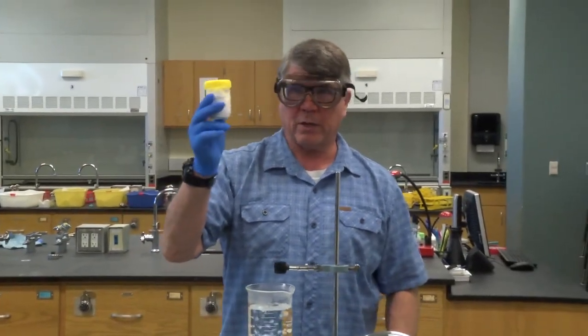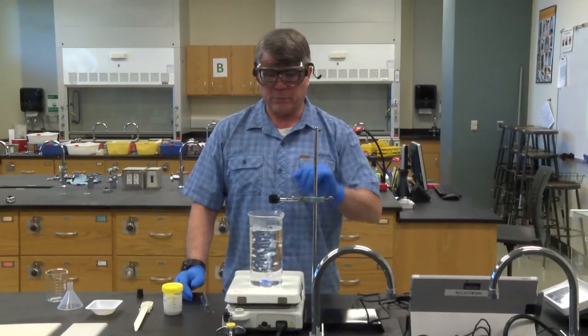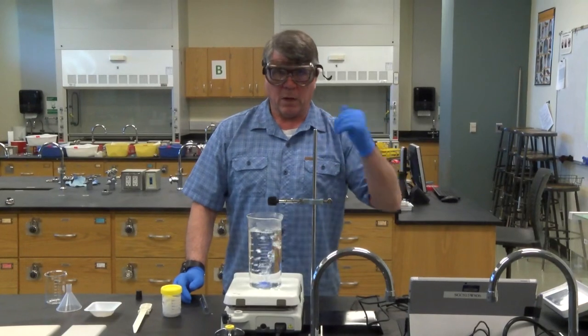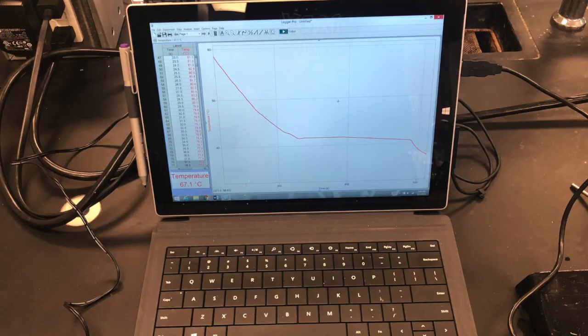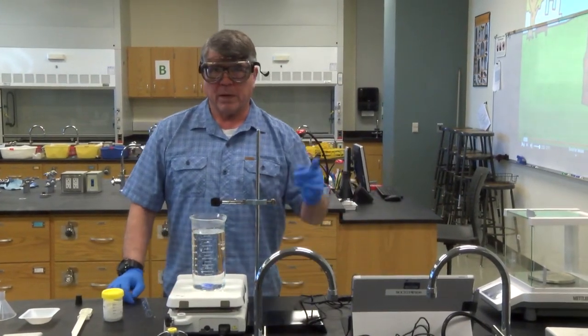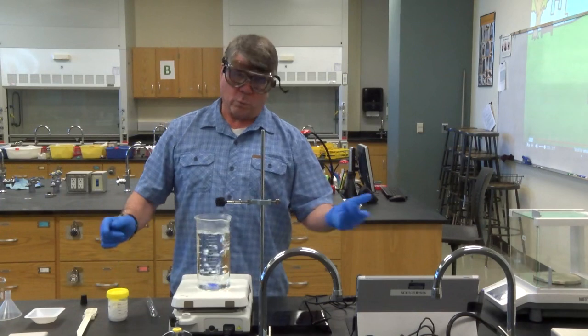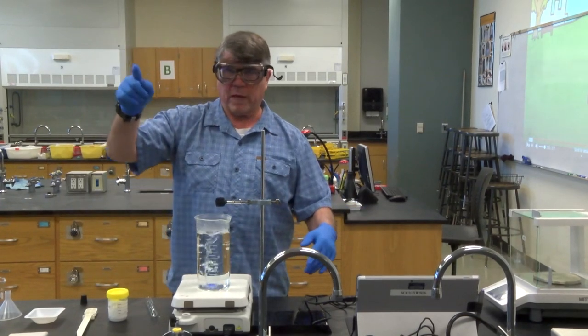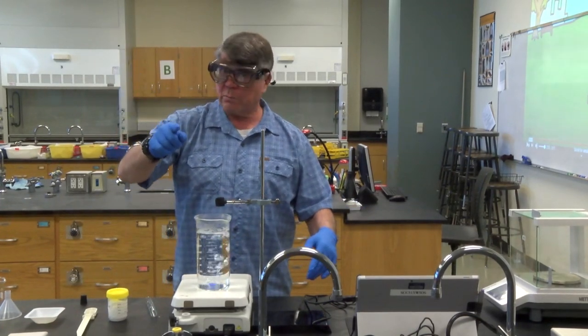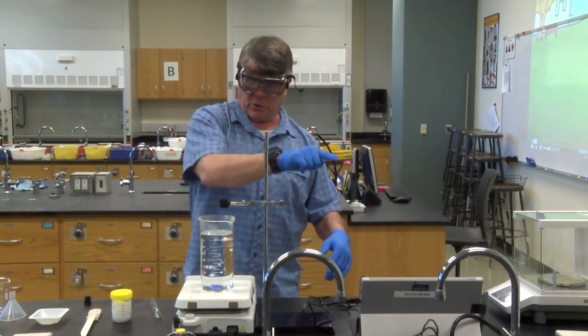So what you're going to do is you're going to melt it, or I'm going to do, I'm going to melt it and then record the temperature on the Surface Pro and LabQuest as it freezes. As it freezes, this will plot a graph of temperature versus time. What it will look like is the temperature is going to go down over time until it hits its freezing point, at which point the temperature will stay constant, and then once it's completely frozen, it'll start going down again.